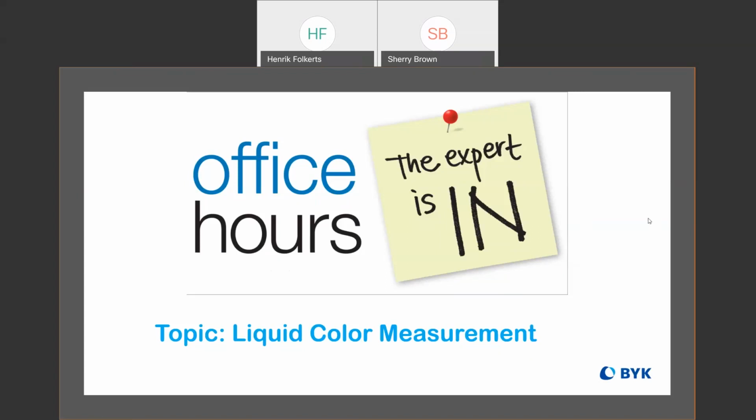Sure. So I have a couple of different instruments here where I'm not actually getting the same APHA results. My curiosity is the old Nessleriser tool where you've got the 300 millimeter path length, and you're comparing the two little glass wheels and so forth. It seems like in the base of those old instruments, there's a filter that's focusing strictly on the yellow range. Do the digital instruments like the BYK LCM and LCS integrate only that range, or are they looking at green and red and purple and orange and every single color under the sun, or are they strictly focused on that same series of wavelengths?